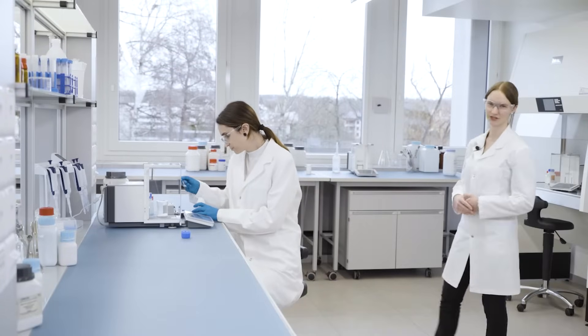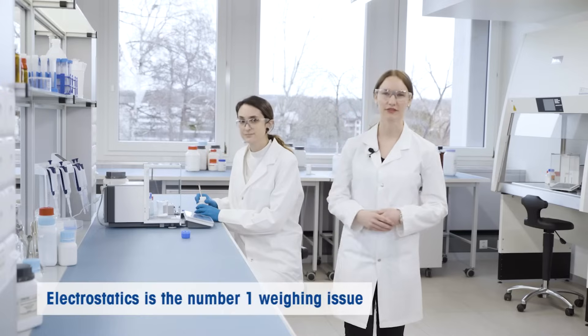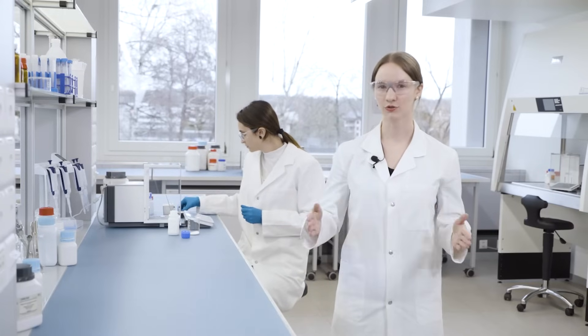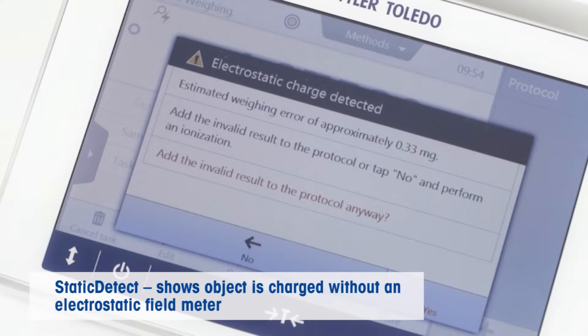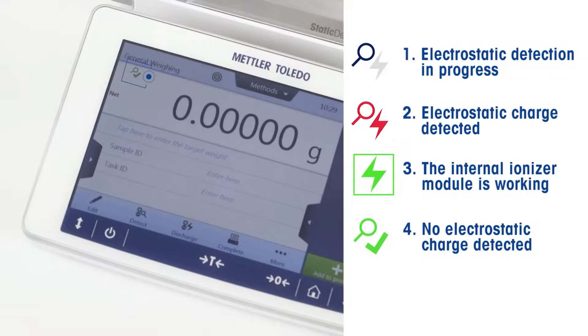Drafts and temperature differences are not the only disturbance when weighing. Electrostatics actually have the largest impact. The XPR's patented anti-static solution puts a stop to this. Not only does it detect charges and indicate the measurement uncertainty resulting from it, an optional ionizer module that can easily be inserted in the back of the weighing chamber immediately and automatically eliminates charges on your sample vessel and gloves to assure accuracy of your result.